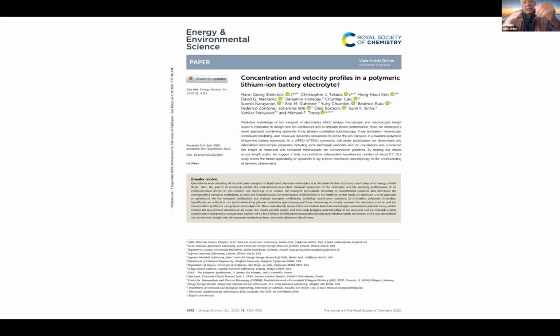It was the electrolyte in the film that relaxed as the ions went through, that we were looking at the dynamics of. So a lot of these things where you see an apparently uniform ballistic velocity through the film, we have to examine very carefully whether that's actually the particle moving or whether there's some other kind of density fluctuation associated with it that's moving.